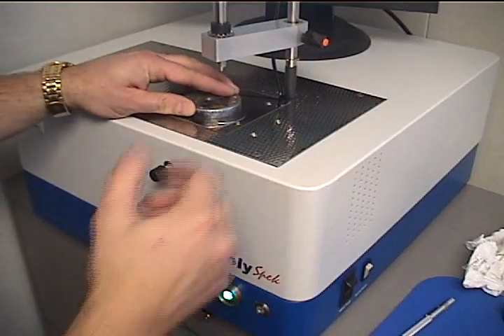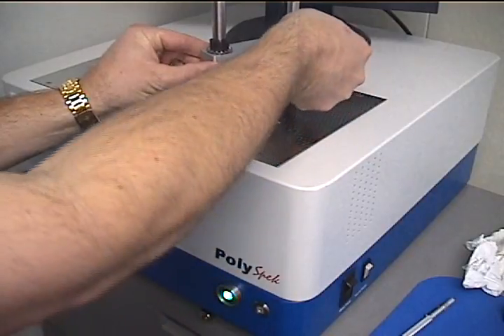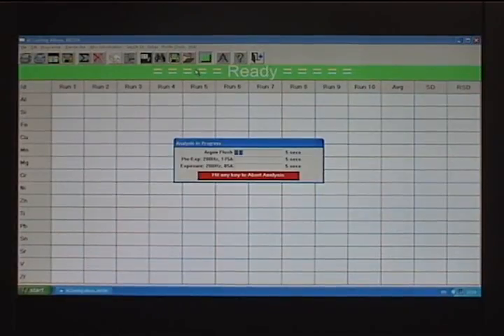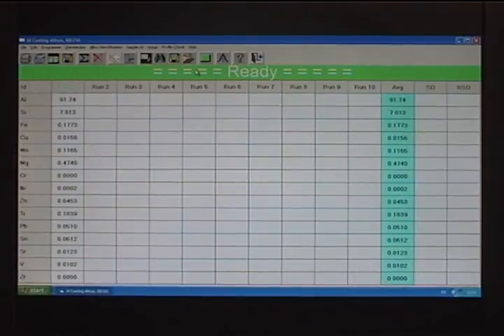Analyzing a sample is very simple. First, the sample is placed onto the spark stand, the clamp is lowered, and the start button is pushed. On screen, the analysis in progress window comes up, showing the operator where the system is in the analytical cycle. The argon first flushes the spark stand for five seconds, then sparks the sample under high energy conditions for five seconds to excite the sample, and finally drops the power of the burn and tells the computer to look at the light from the sample for the final five seconds. When the process is finished, analytical results appear on screen.